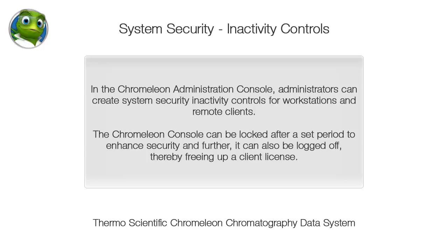In the Chromeleon administration console, administrators can create system security inactivity controls for workstations and remote clients. The Chromeleon console can be locked after a set period to enhance security, and further, it can also be logged off, thereby freeing up a client license.